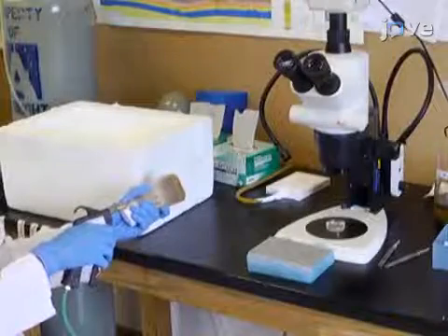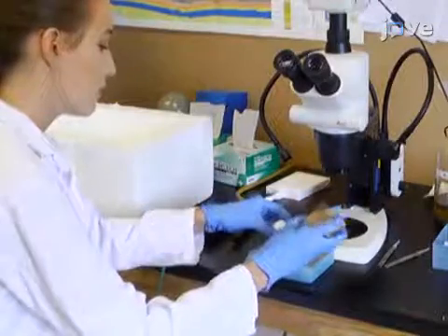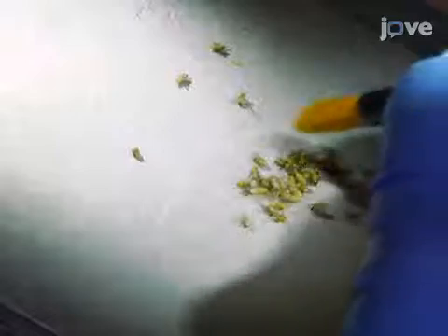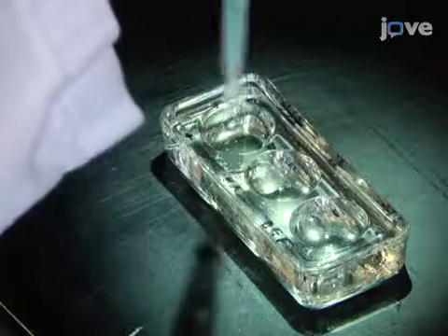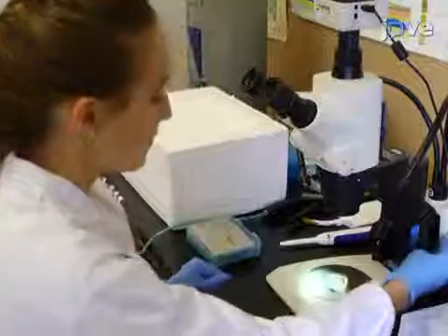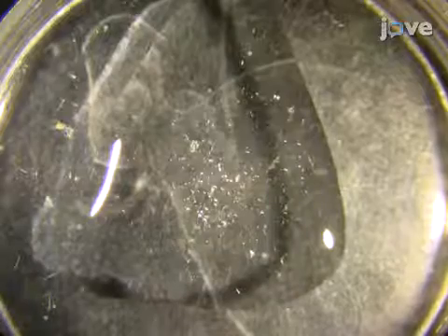To set up for the dissection, place the anesthetized flies of interest on a cold metal pad or in a petri dish sitting on ice. Alternatively, use a fly pad that emits carbon dioxide. Next, place a small amount of PTN in the center of the dissection dish to create a bubble of PTN. Then, under a stereo microscope, fill the field of view with the PTN bubble under uniform illumination.